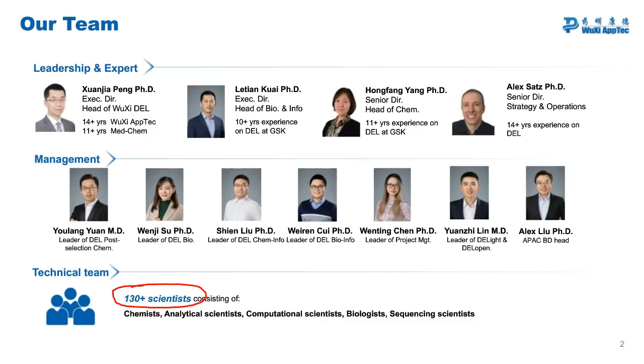But there is a chance that if you have a very nice binding pocket and then you have another, let's say a shallow binding pocket, you would only find binders for the better-formed binding pocket. But still, that is going to be target dependent. It's going to be hard to find binders against a shallow pocket when there is a nice pocket there as well.